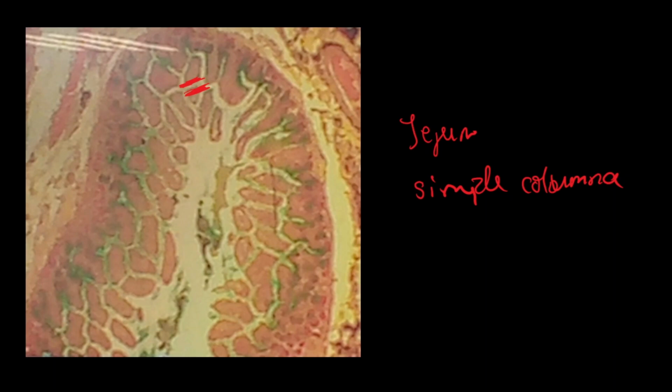Okay, if we take a look at this part of the epithelium, for example, we can see that it actually forms a column and it's directly attached to the basement membrane as a simple columnar epithelium. However, the cracks and empty spaces we can see here is an example of an artifact, a shrinkage artifact that is caused as a result of cracking in faulty techniques of tissue preparation.